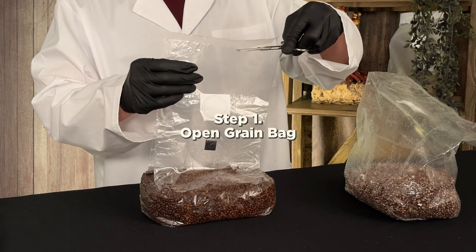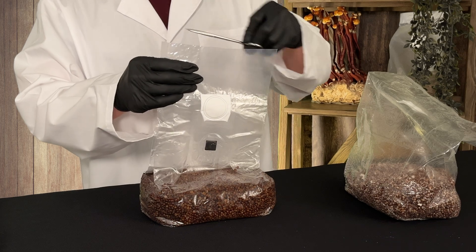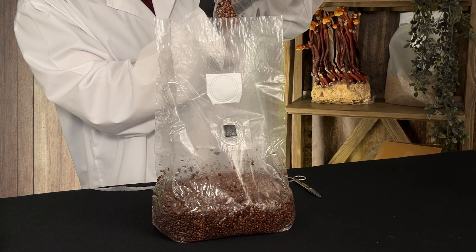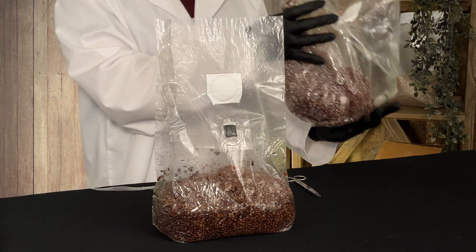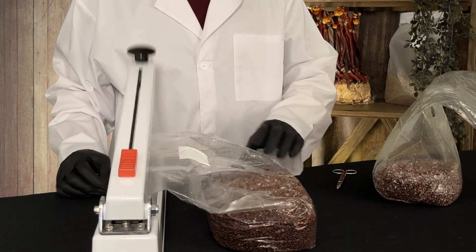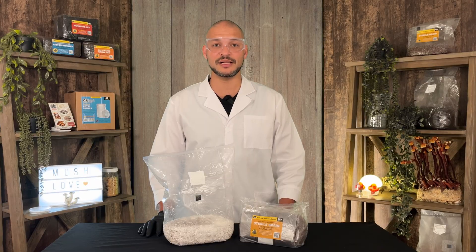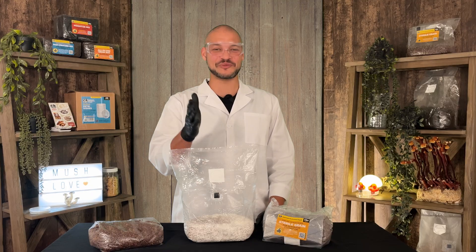Inside your workspace, open the colonized grain bag carefully to avoid introducing contaminants. Carefully pour a small amount — about five to ten percent of the total grain — and sprinkle it evenly into the fresh grain bag. Seal the bag immediately after transferring. Incubate at 70 to 75°F — the mycelium will spread quickly, often fully colonizing within seven to ten days. You are now an expert in inoculating grain! You can tell when your grain is fully colonized when it's nearly fully covered in white mycelium.